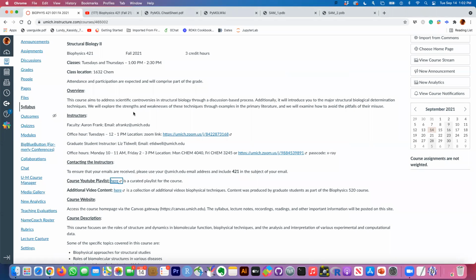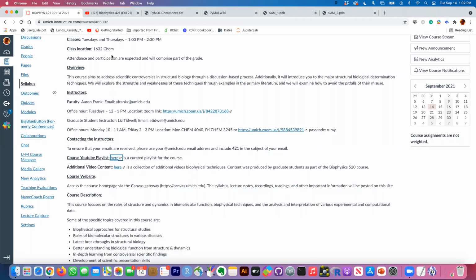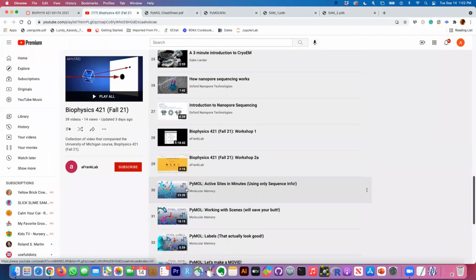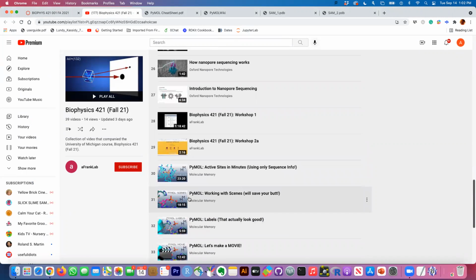Okay, so something that I forgot to mention last time, or send out an announcement about, is the fact that the video for the last lecture, the workshop we did, is on this playlist. So if you scroll down, you'll find it right here, right? So this is the Biophysics 421 Fall 2021 Workshop 1, right? And so you can find the entire video there. And today, as I said, we're going to be working with PyMOL.